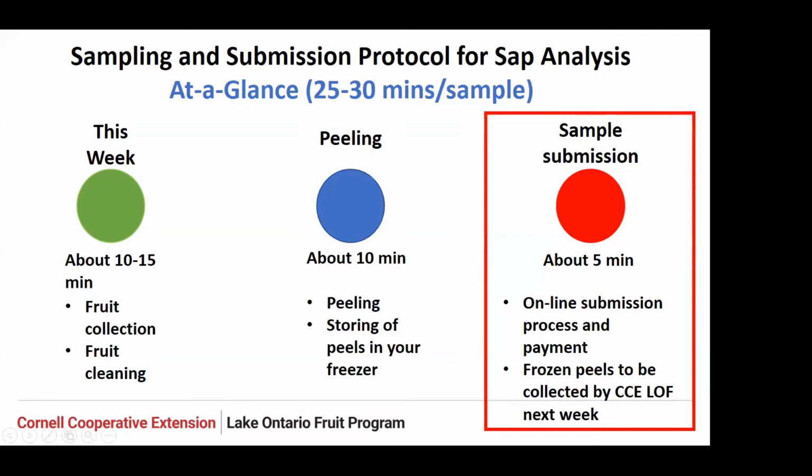Questions? Okay, we have a question in the Q&A box. Given the issue of calcium residue from sprays, would you consider a normal water wash before rinsing with distilled water? Normal water. Okay, we haven't been using that kind of water, so we want to be very careful. It's not gonna take 1 single minute to go to Tops and get purified water or distilled water. You should use the right kind of water, not any water coming from the hose that can have any kind of residue coming from there.